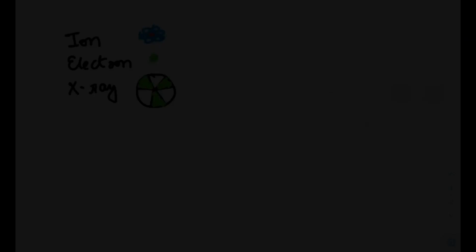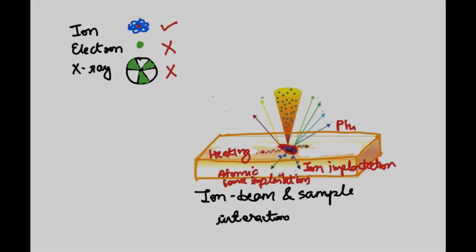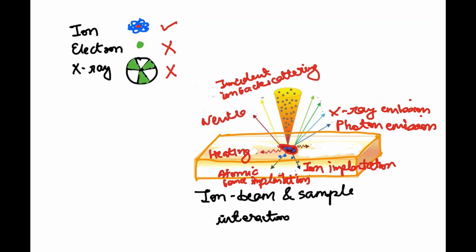In general, most of the analytical methods either involve electron beam, X-rays, or ion beam. In SIMS, as the name suggests, we are interested in ion beam to do our analysis. When energetic ions impinge material, different interactions between surface and ion beam can take place, resulting in elastically or inelastically scattered or recoiled incident beam, aka secondary emission pattern. In addition to release of characteristic X-rays, photoelectrons, backscattered electrons, etc., an incident beam may cause ionization of the sample. In SIMS, we monitor these secondary ion species.